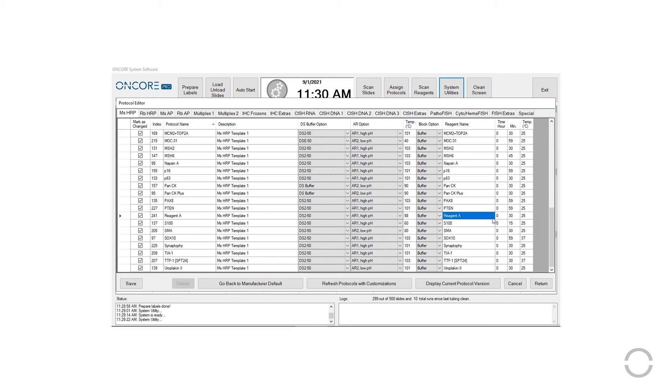From the protocol editor, the user may also customize these parameters on any existing protocols.